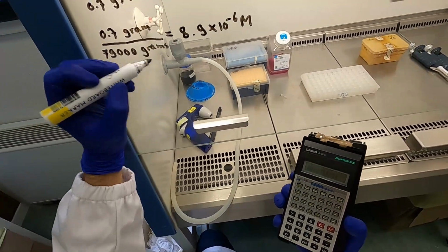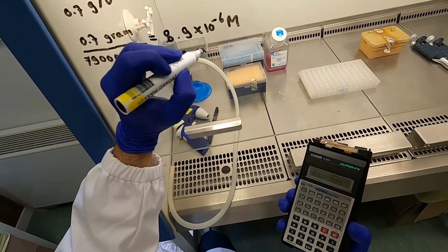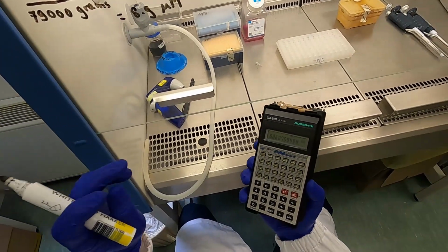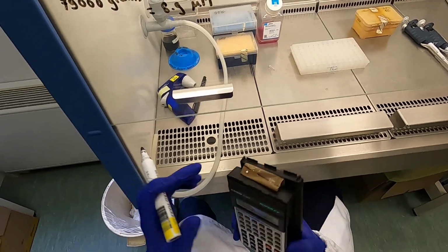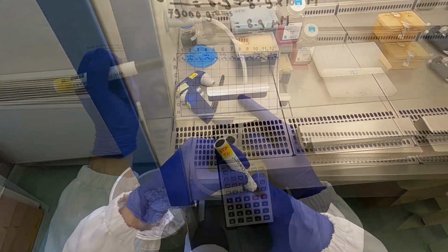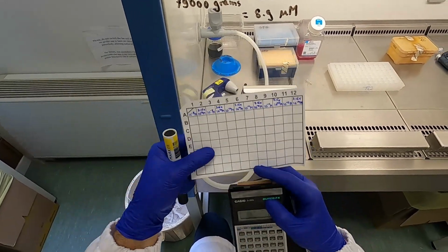So the concentration in the tube is 8.9 micromolar. So we want to start with the first well at 10 to the minus 8.